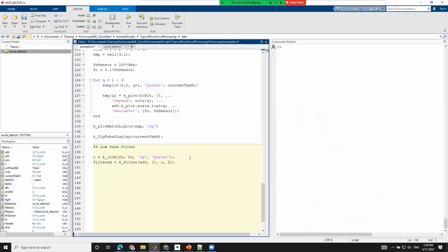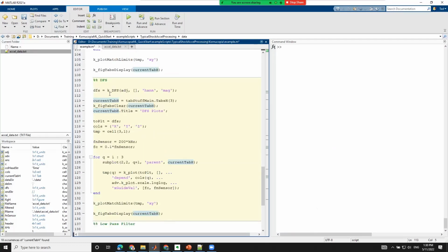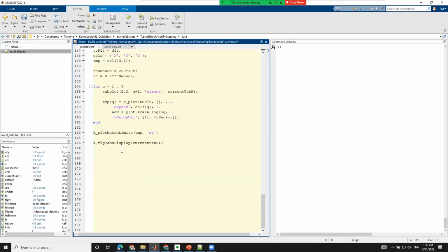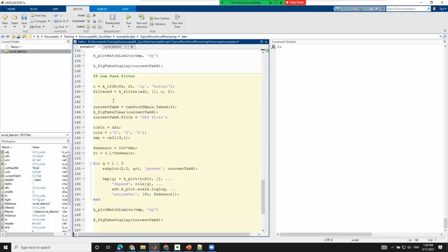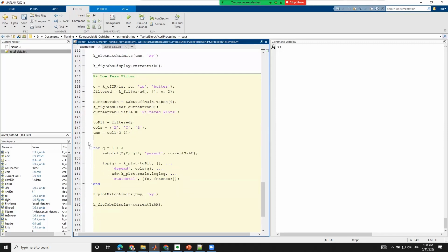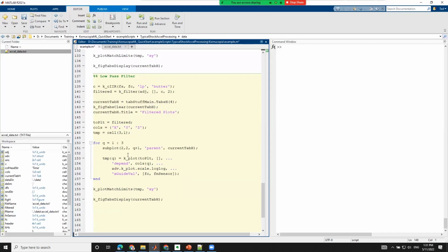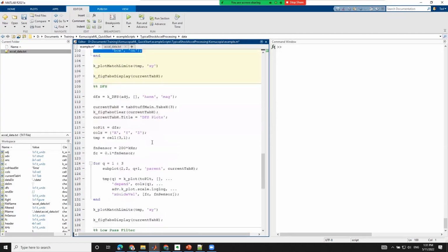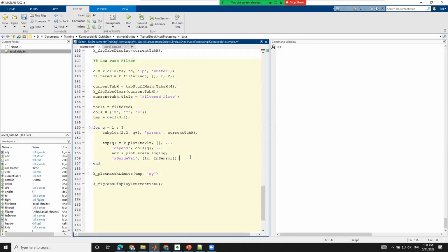All right, so now we want to make our plot. So let's go make the plot. And again, we just go up here and copy what we did before. We're going to go on to the 4th page of our notebook. And this is going to be filtered. So what we're plotting now is the filtered stuff. All this stuff keeps the same. We don't need this. But it would be nice to have the peaks back. So we'll go copy the peaks stuff from before, and we can just plunk it right in here.